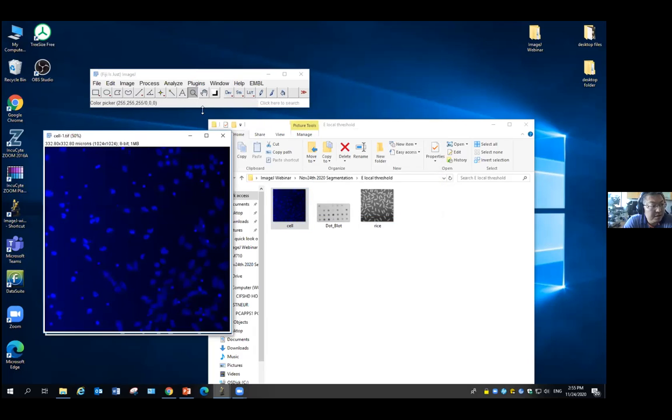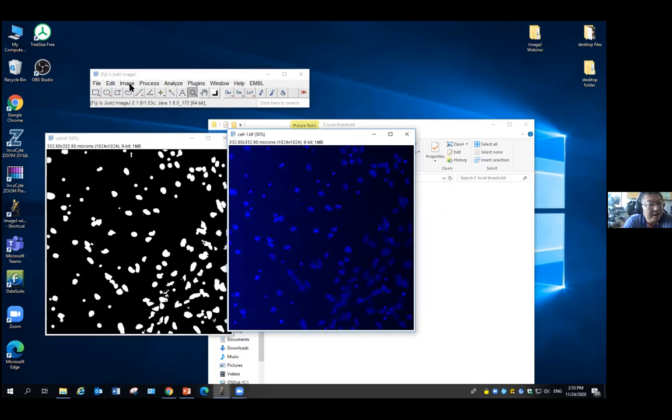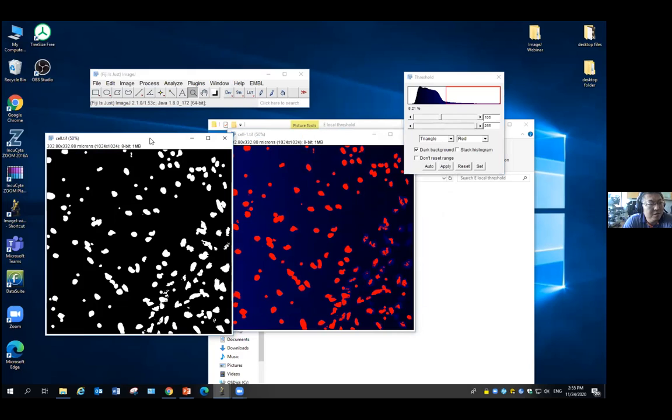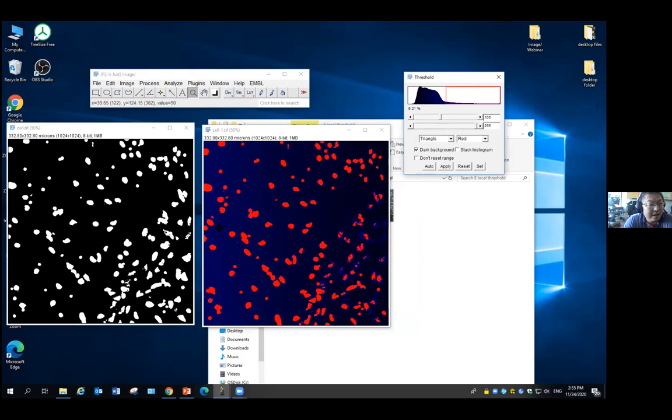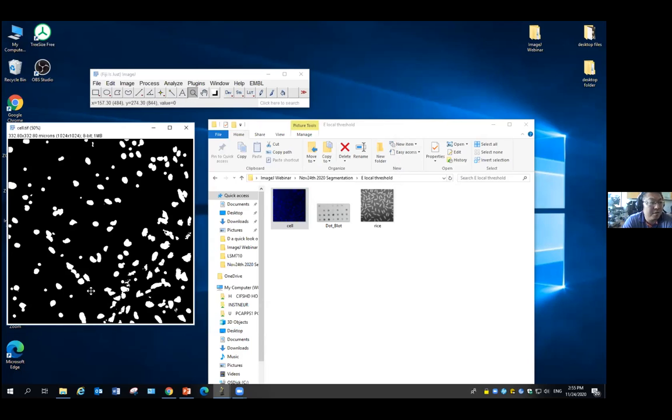So this is the image, and this is my mask. As you can see, this works much better than a single threshold. Here I can do this and it looks much better, but on the left side I don't get those settings. If we match the right side, then the left side doesn't really work. But if you use local thresholding, it calculates based on your environment and tries to guess what your background is. That works much better. Okay?